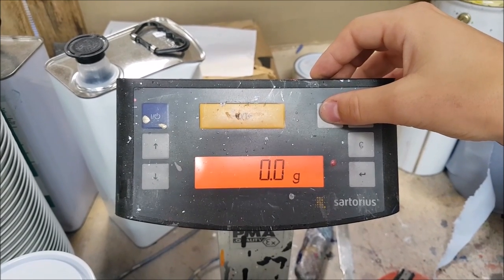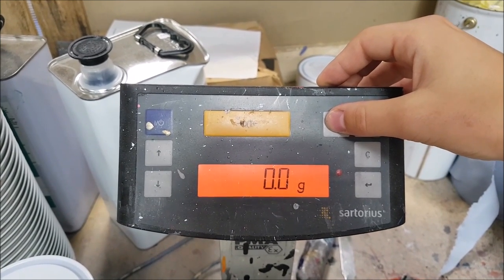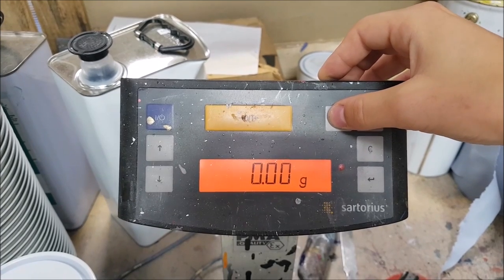This is a video to show how to use the scales and measure in 0.0 to 0.00.